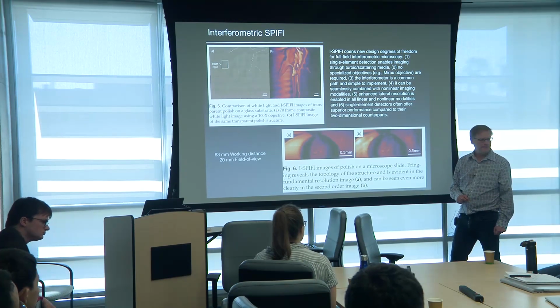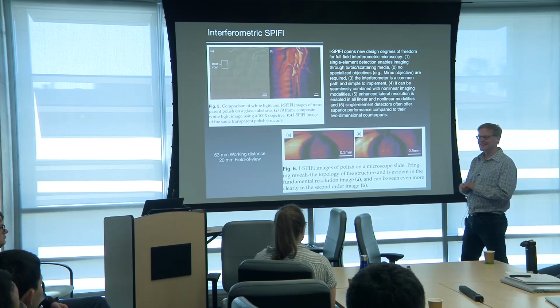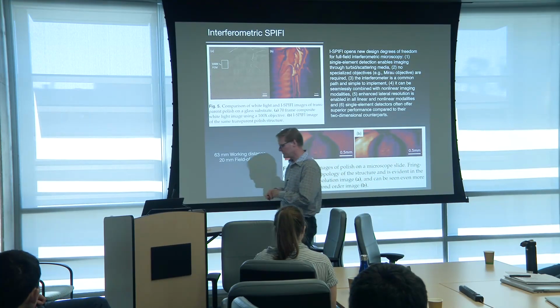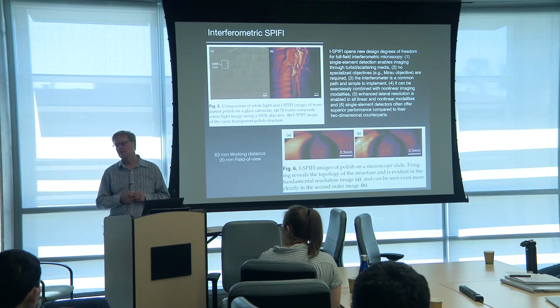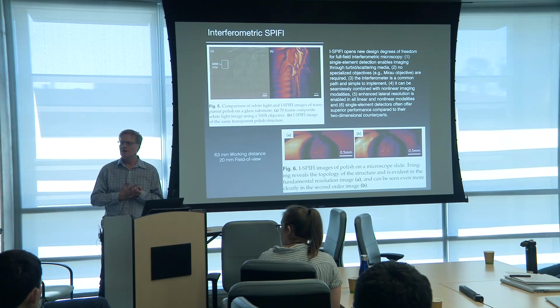And if anyone has any interesting phase specimens, like I said, these are my idea of phase specimens. Many years ago, when imaging cultured neurons, for instance, you would be able to see what happens when the action potential occurs. Right, because of the index change, a small variation of the pathway.